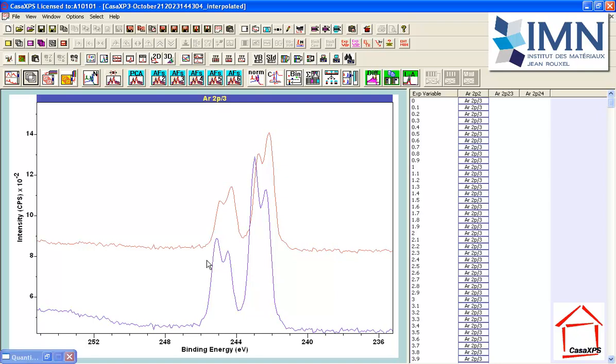And this is really quite an important point, is that XPS contains a wealth of information, and that information is often lost by noise or just making some basic assumptions about the peak model. Now, having analysed these data in this particular way, I've got a structure here that is in the background that to me is significant. And the reason this is significant is because I anticipate that this could be a surface plasmon that is being generated by virtue of the fact that the argon is implanted in aluminium.